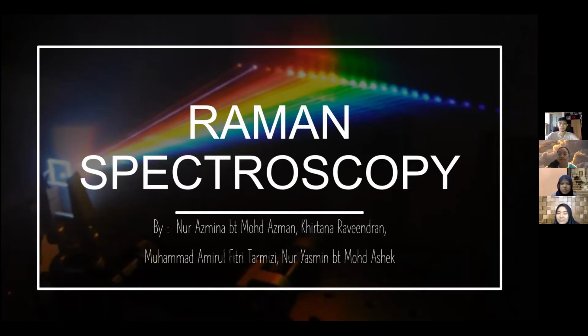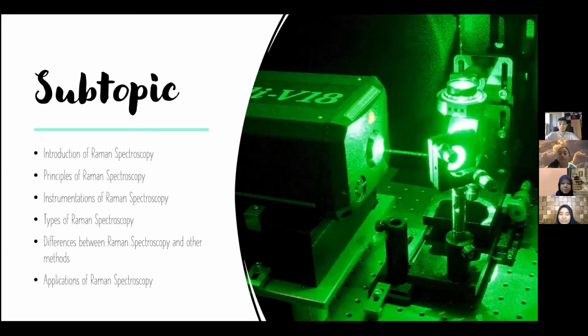Okay, next slide. So in this presentation, you will go through all these subtopics and learn more about the introduction of Raman spectroscopy, the principle of Raman spectroscopy, the instrumentation, types, the difference between Raman spectroscopy and other methods, and the application of Raman spectroscopy.